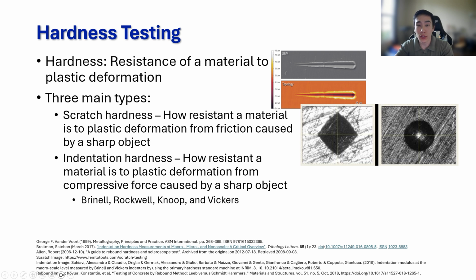The next test we have, and the one we'll be focusing on today, is indentation hardness. Indentation hardness gives a direct hardness measurement, generally in terms of compressive force applied in an area of deformation. However, the units aren't intuitively represented and are usually unique to the test performed. Due to their ease of use, inexpensive cost, and useful information, they are commonly used in various industries such as automotive, aerospace, structural development, and mining, and multiple tests have been designed, like the commonly used Rockwell, Vickers, and Knoop.